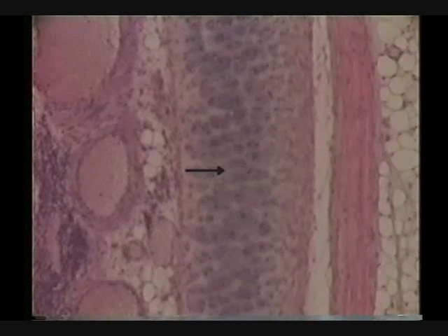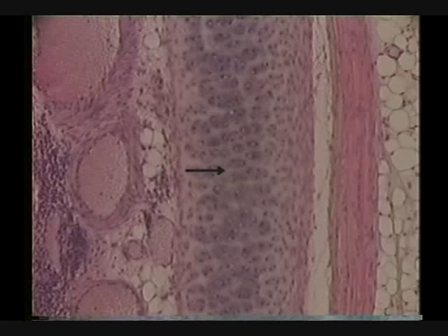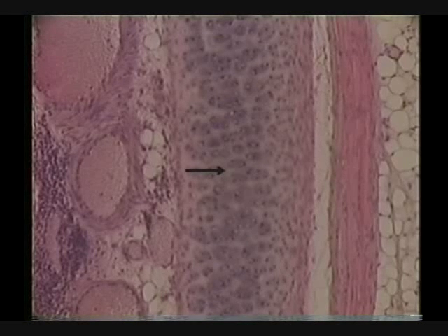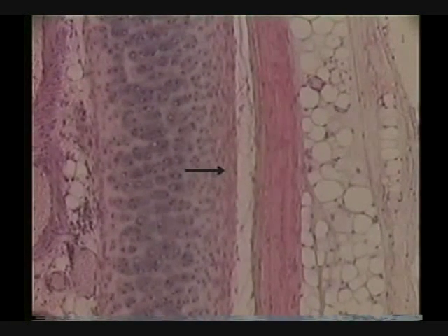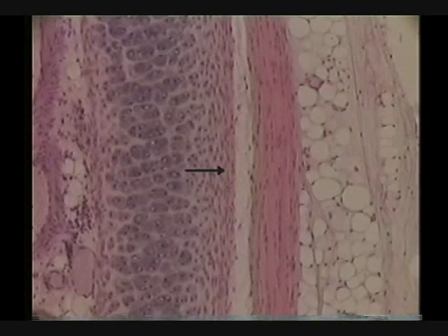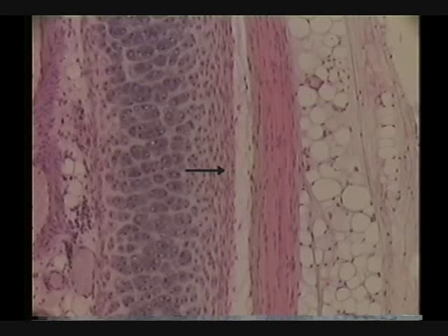Identify the tissue indicated by the pointer. The tissue is hyaline cartilage. Identify the layer indicated by the pointer. The layer is perichondrium.